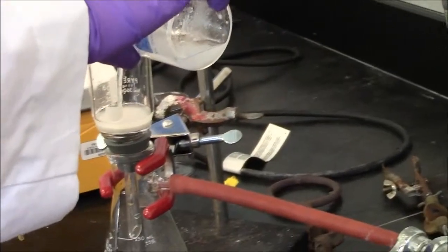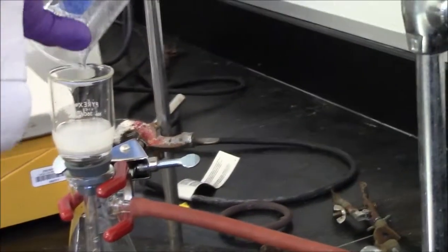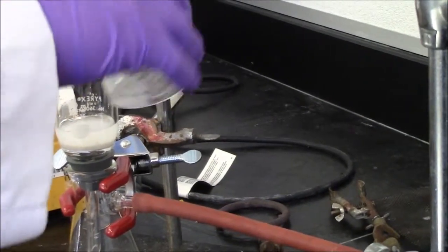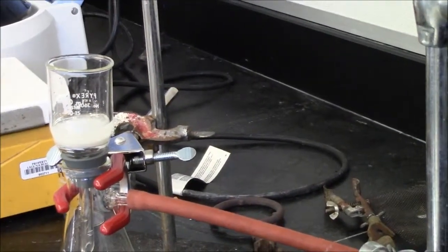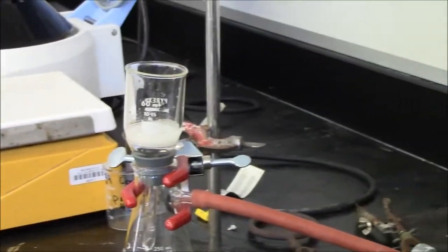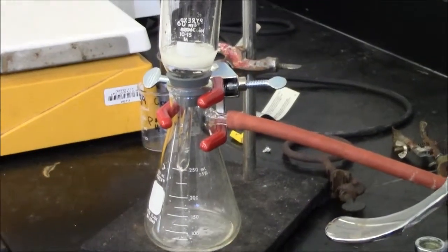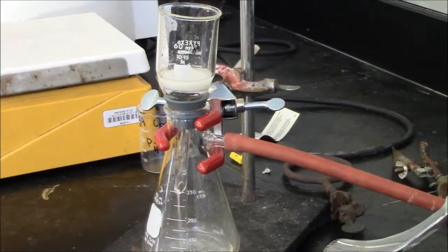When you actually do vacuum filtration, you'll have a slurry that is crystals in some sort of solvent and you pour that in the top of your Buechner funnel. The vacuum will pull the solvent through the frit at a fairly rapid rate, leaving you with the crystals on top of the frit. The vacuum will also serve to dry your crystals.